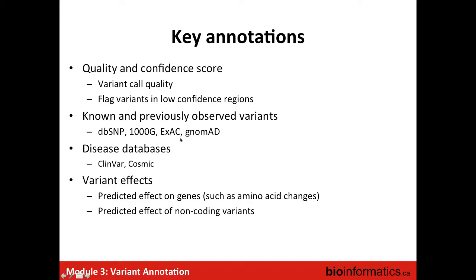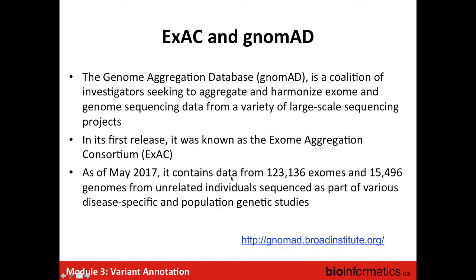So going back here, I've talked hopefully at some level about these confidence scores. I'll now talk a little bit more about the databases that can be used.